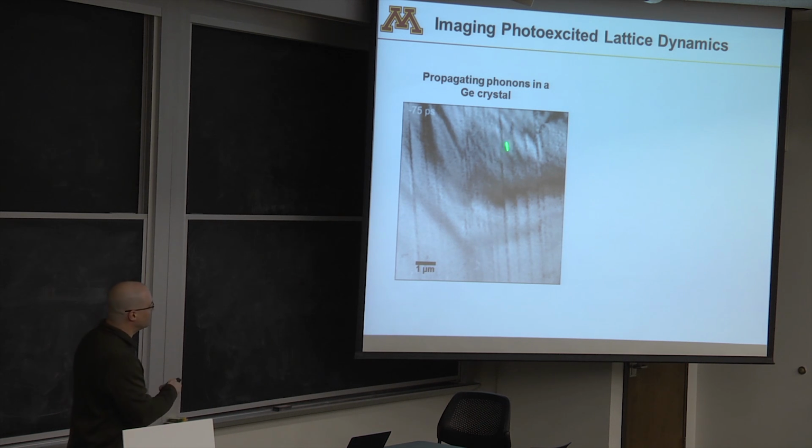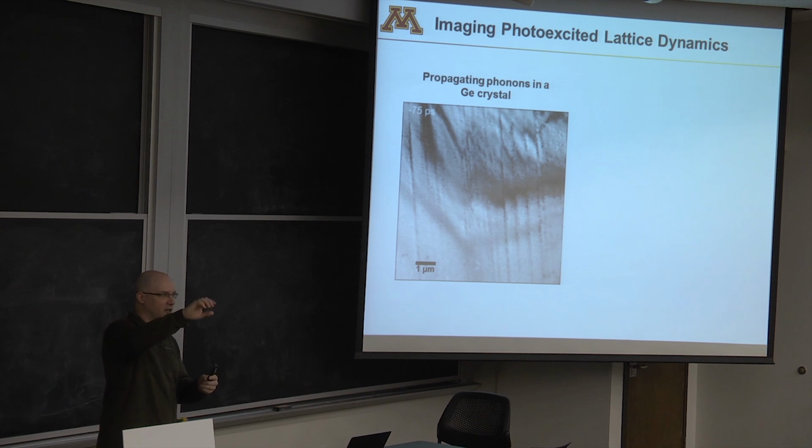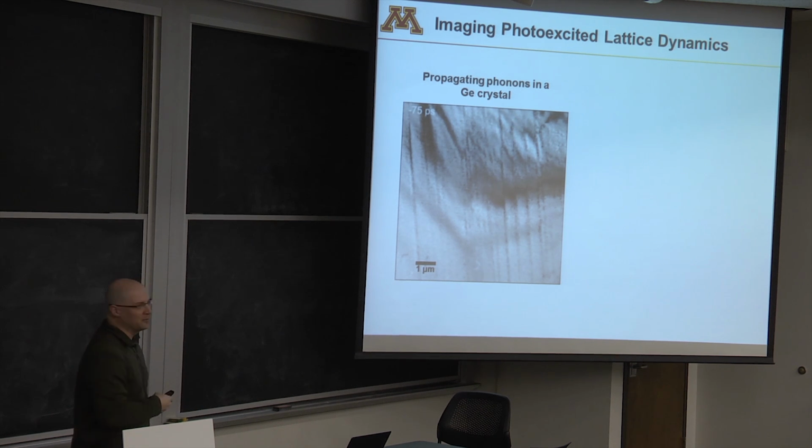And what these little things are, ridges on the surface of the crystal. And they're like 10 nanometers high. They're about 100 nanometers wide. And they always show up whenever you polish these crystals. You just can't get around it. It's because you use different slurries and grits to make these things, okay? So these actually turned out to be really interesting, and we did not expect this at all, okay?